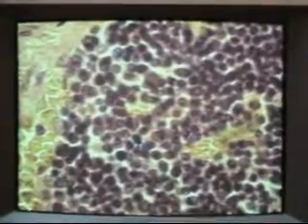And the rest of these small cells with the very dark nucleus are obviously the T cells at different stages of development. And again, if we move out, the least developed cells are in the outer cortex, and as we go down, the cells should show the later developmental stages of the T lymphocytes.